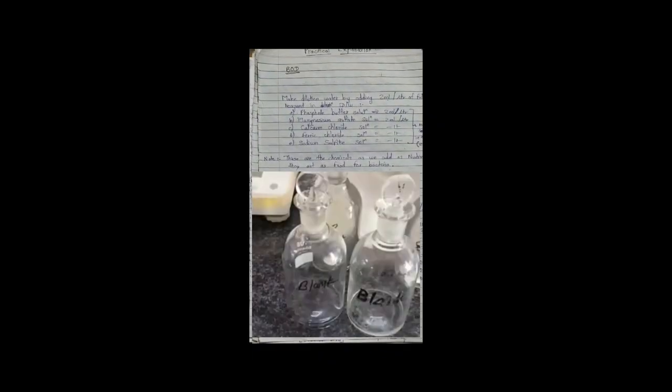Now we discuss how the practical of the blank and sample is performed. Now let's discuss the explanation of the BOD practical, how the blank and the sample are prepared. Here we can make a dilution of 1:40 or 1:50.